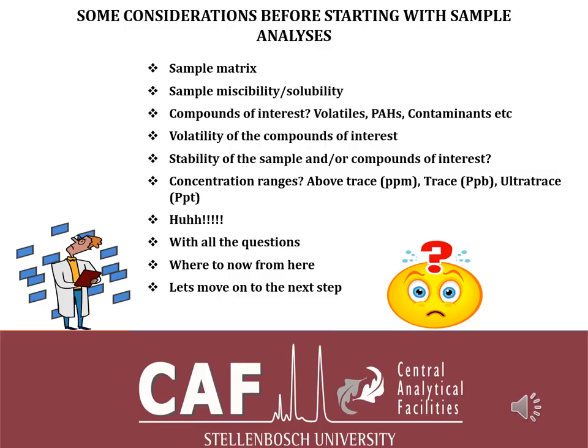Sometimes when we want to do sample analysis, we just get carried away and we forget to pause a little bit to ask those relevant questions. I know there are some clients who come to you and present you with a problem, and they just want you to find a solution. But if you don't ask those questions, you will not be able to give the client the right solution, because you might think you've given them the right solution only to find that you're giving them something different.